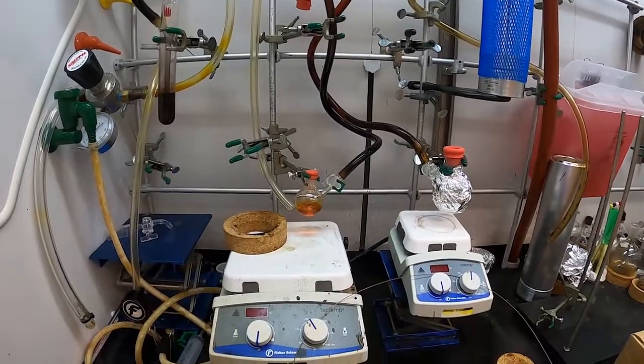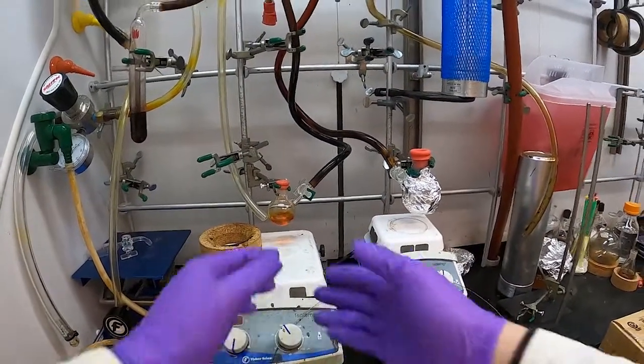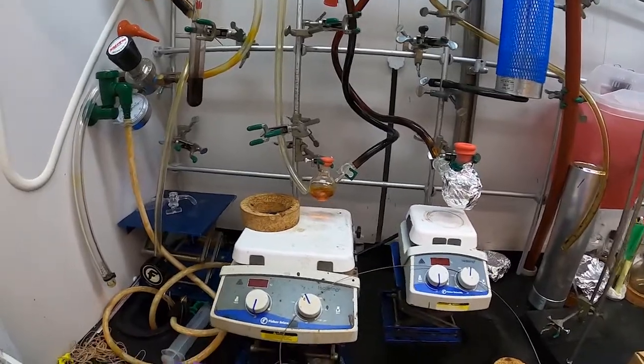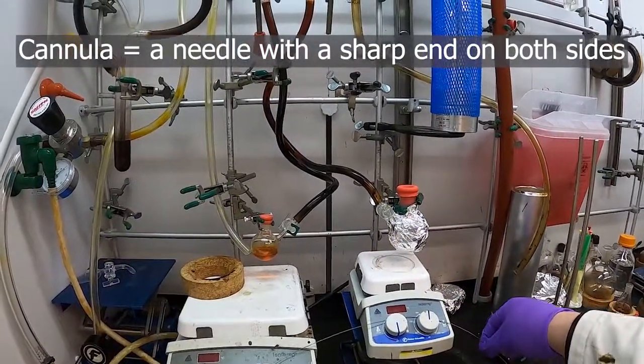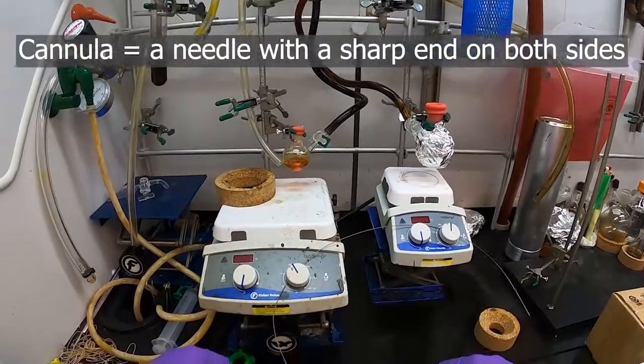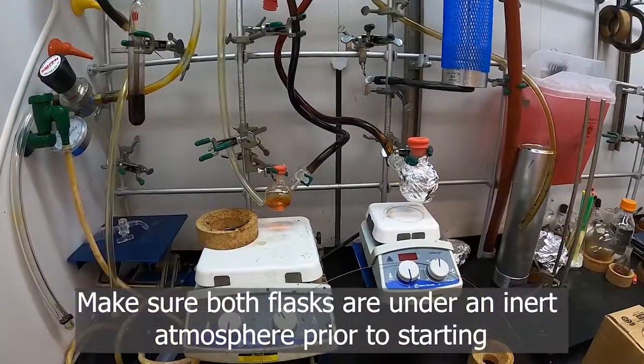Similar to the way we syringed out solvent, another way to move solvent or to transfer solutions from one flask to another is with a cannula. It's just a double-ended needle, but there's a specific way to do this that makes it work best and maintains your inert atmosphere.